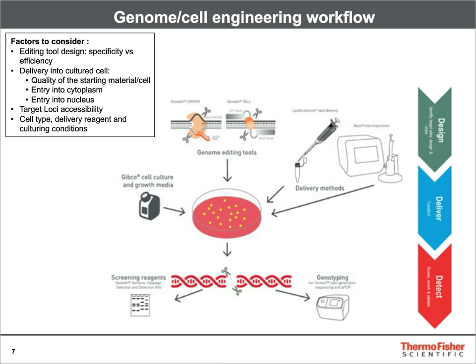There are certain other factors that also play a major role: the target loci accessibility, the chromatin structure at that site, and the cell type that you're working with. Based on the cell type, you need to choose a specific delivery reagent that is suitable for the editing tool that you're using and the cell type of choice, and various other culturing conditions. These are all critical factors for a successful gene editing experiment.